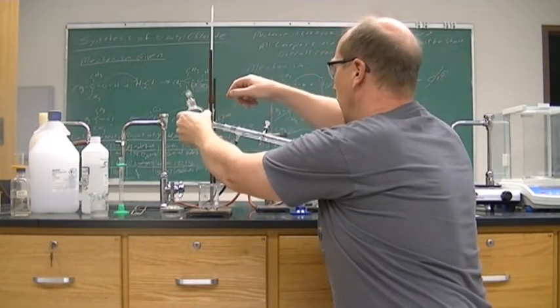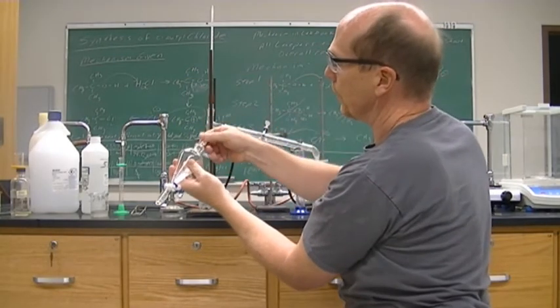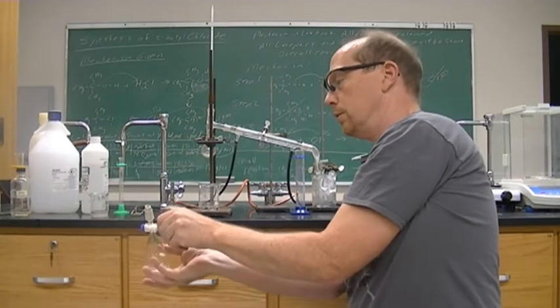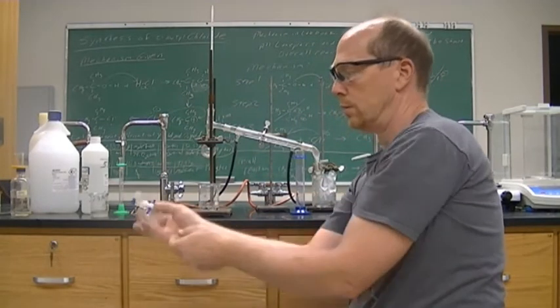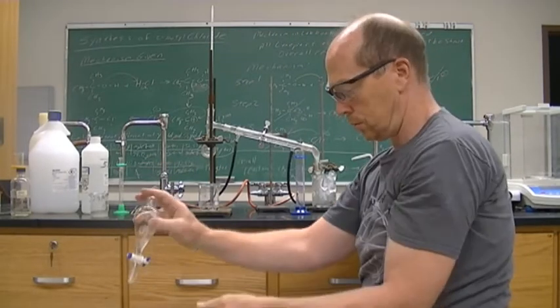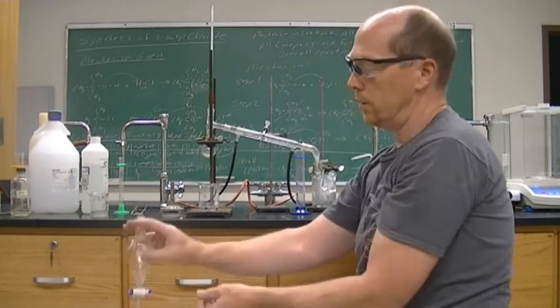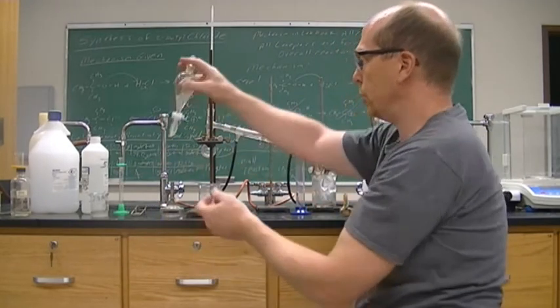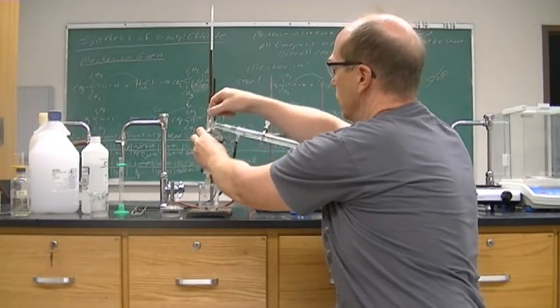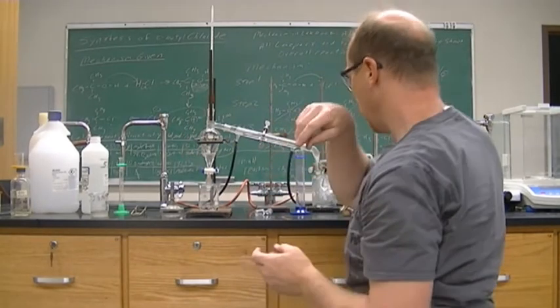All right, so this is the last washing with water. Get this lined up correctly. All right, so it's lined up correctly. And this is how you wash a liquid. All right, and so that is our final washing. Once we separate this, we're going to then dry it.